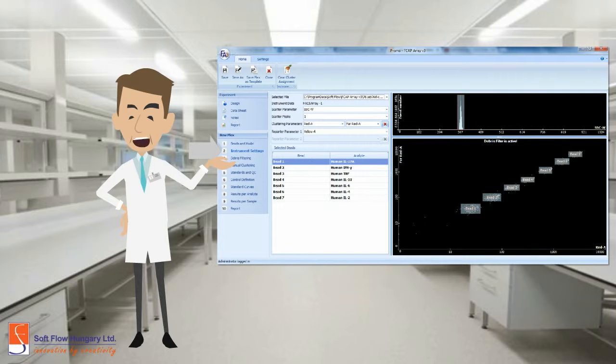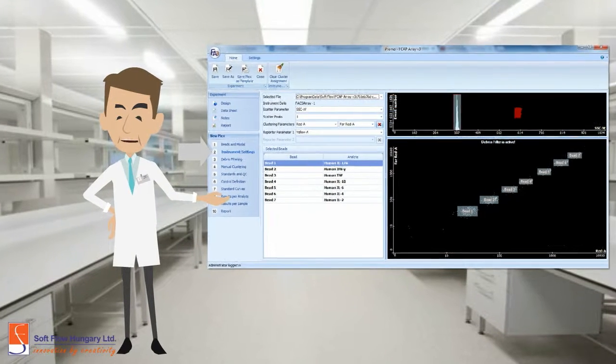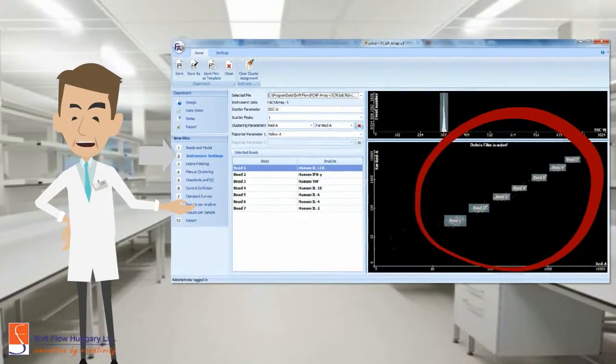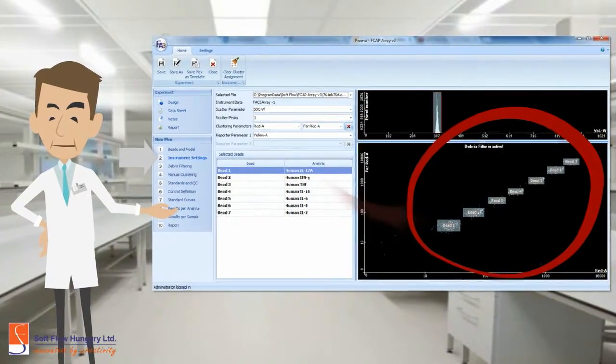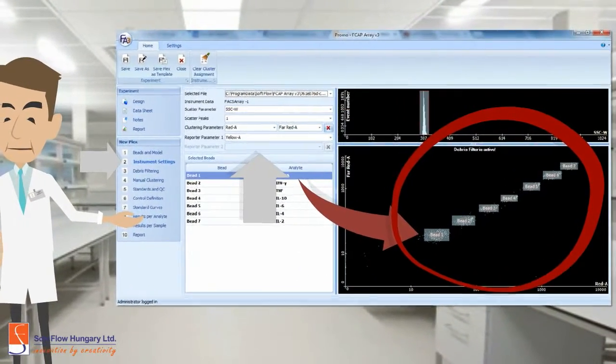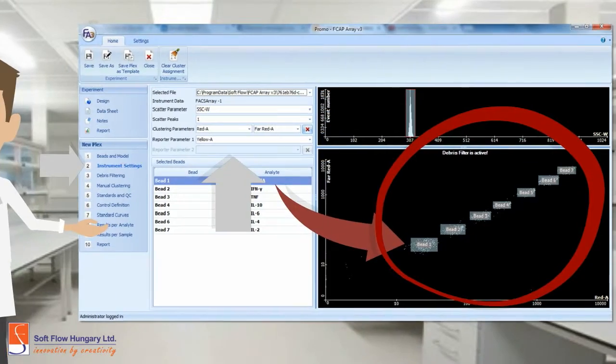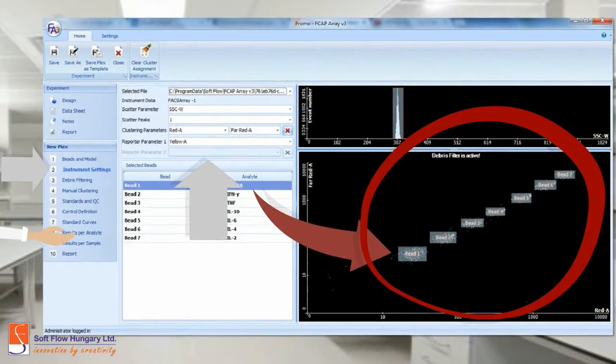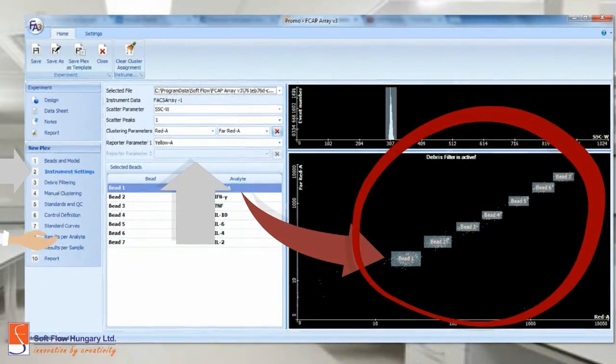You have to associate the cluster with their respective bead by dragging and dropping it. Plus, you can modify the parameters to the best fit to your experiment.